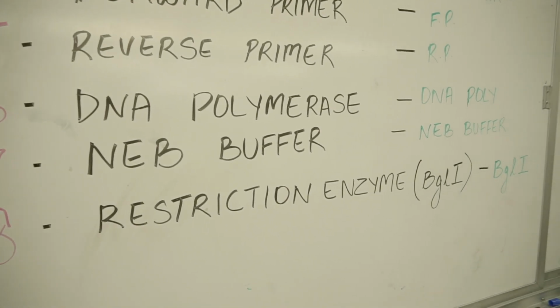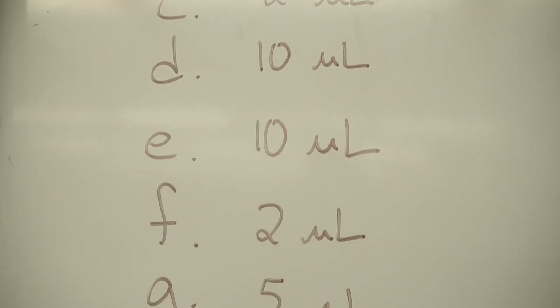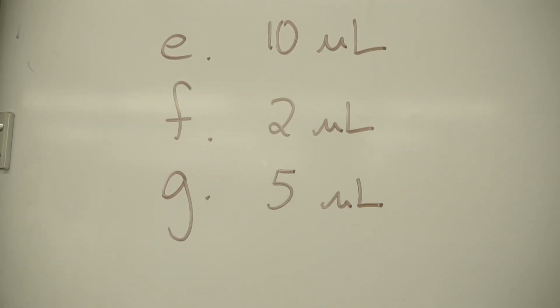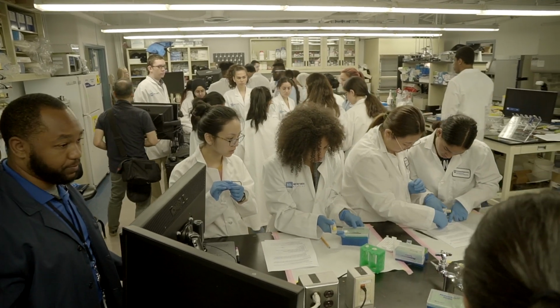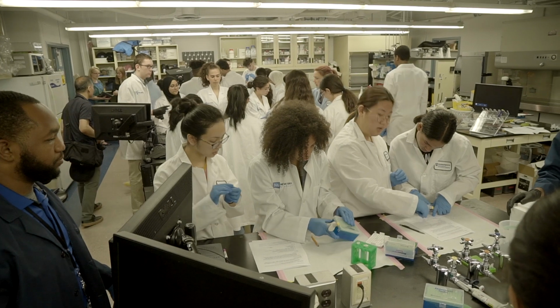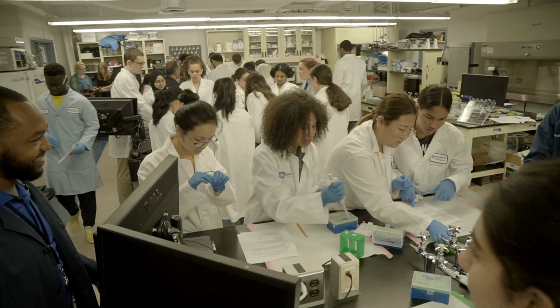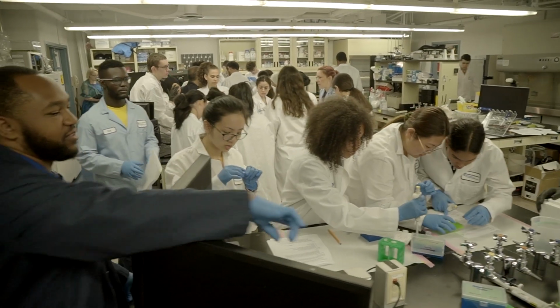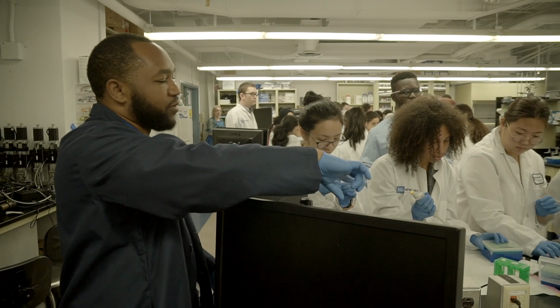The bad news is we only have 2 small pipettes. We should have 3 or 4 of the pipettes, but let's get started with the water. There's one tube of water for each of you. This is special water. This is molecular grade water. The super tiny tips only work for the P2s. Most of you are going to use the bigger tips.